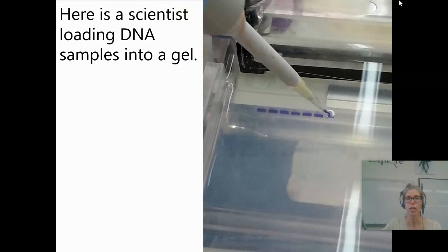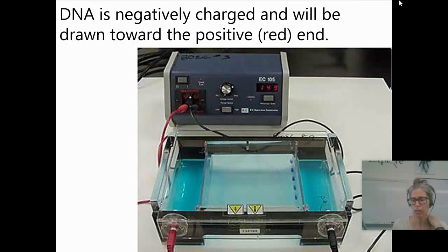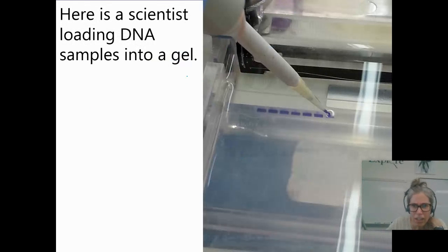Okay, so here's a scientist loading DNA samples into a gel. Each of my cohorts who come in in person, I hope will get a chance to load those gels. For those of you who are remote, I'm going to show you a video of that. So here's what actually happens. Here's the gel right here. You can see it kind of ending right here. It's in a little plastic container, and then you load these wells. If you look at them from the side, they're not all the way through. They're these little wells like this.